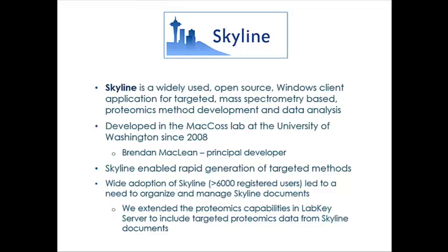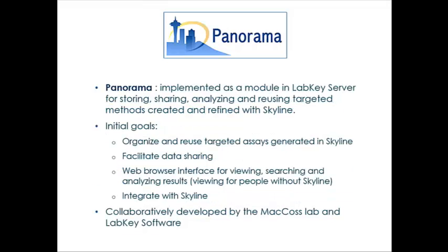So as Skyline usage shot up, we realized very quickly that we needed a way to organize and manage all the Skyline documents that were being generated in various labs, including our own. And since LabKey Server already had great proteomics capabilities, we decided to extend that to add support for targeted proteomics data contained in Skyline documents. And that is how Panorama came about.